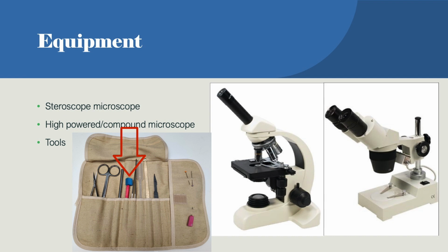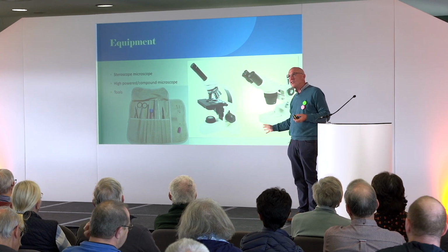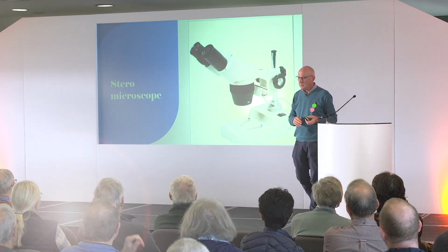And a seeker is a very sharp, pointy thing, and that's what you play with when you're actually looking at things. So a toolkit is not an expensive thing. To get started, it's slightly cheaper than getting started at beekeeping, but the cost doesn't go up much more.